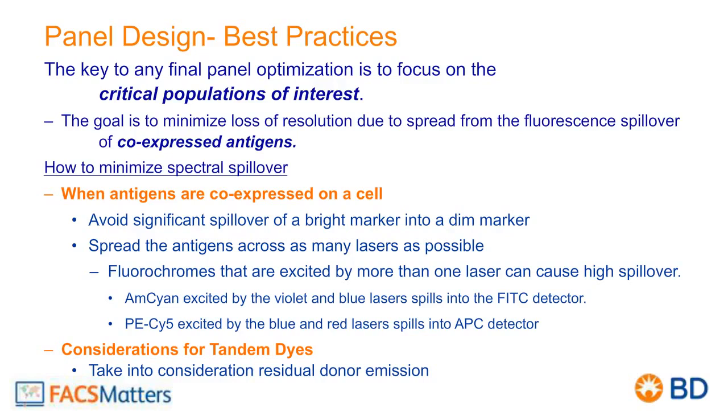So when the antigens are co-expressed, avoid significant spillover of a bright marker into a dim marker because you're going to get more spread. When you can spread the antigens across multiple lasers, that will usually decrease the amount of spillover, although there are fluorochromes that have multiple laser excitation, and that can still cause you problems.